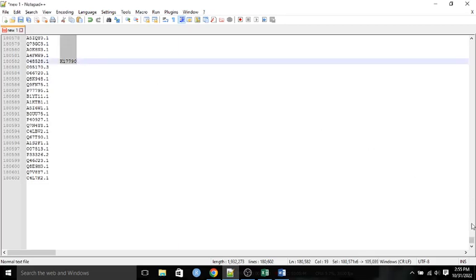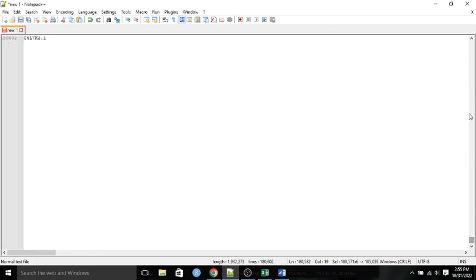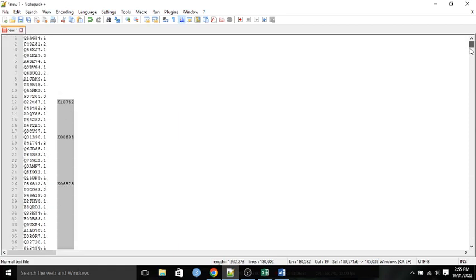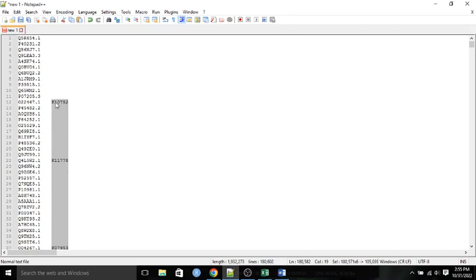I've selected my data. The first one was our data, and this is in KEGG, and KEGG gave us a result about the KEGG KO, which means KEGG orthology. So we have selected our data. Now let's note this. I also copied that data, but let's note this.